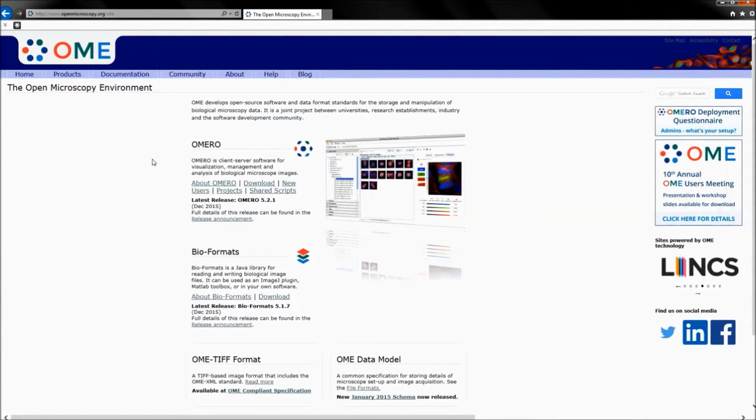OME will allow you to search all of your imaging data at once, and with the OME XML present in the image header, it allows you to filter and search by any parameter saved inside the metadata. OME also includes a bunch of other handy tools for image editing, analysis, and figure preparation. Many programming environments, such as MATLAB, LabVIEW, and Python, have XML handling functionality available. This means that OME-compatible metadata can also easily be used in any custom-written analysis routine.